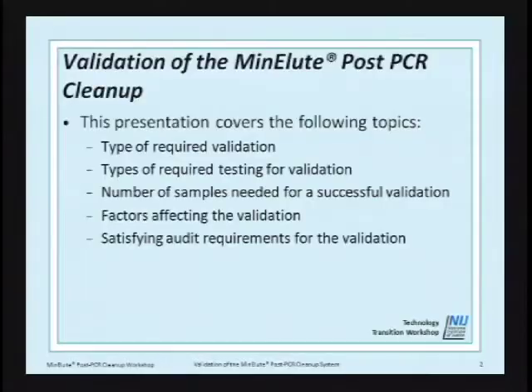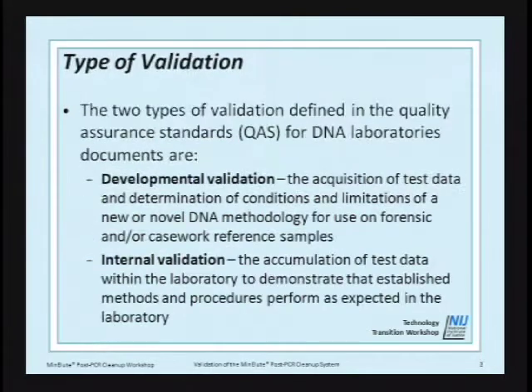So the validation of the MinElute post-PCR cleanup. I'm going to cover the following topics: the type of required validation, the types of required testing for that validation, the number of samples needed for successful validation, factors affecting the validation, and satisfying audit requirements for the validation.